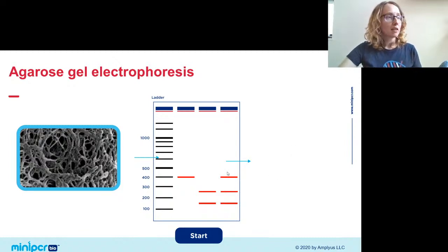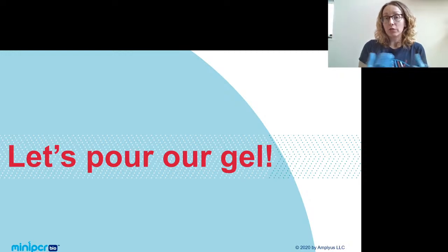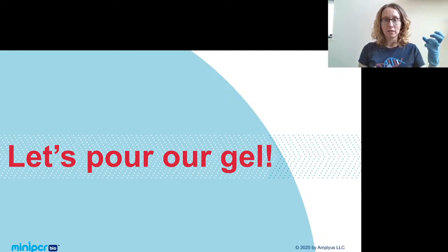So that's a gel, a gel electrophoresis in a nutshell. I'm actually going to cast a gel that we'll use today in our lab live for you right now. So let's do that. Now if you've learned gel electrophoresis already, you might have learned it the old-fashioned way that I learned it. You take your agarose. It has kind of the texture of like white sugar, sugar crystals. You measure it out with a scale, then you mix it with buffer. We're going to make it a little easier on ourselves today. We're going to use gel green agarose tabs.